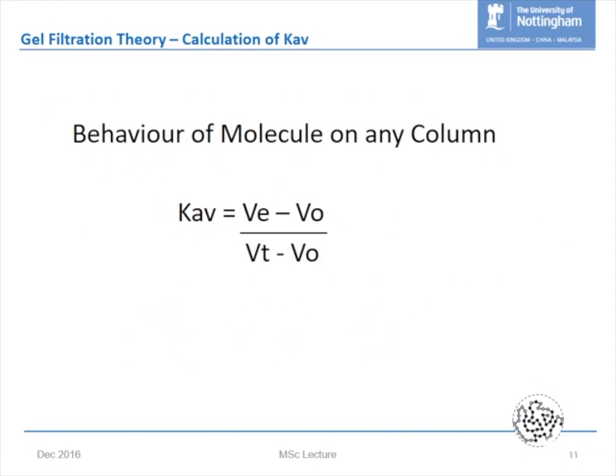You probably just need to get your head round some of those terms, but it's very logical in terms of this distribution into the pores. It's only based on the volume of the pores. And we can come up with a term like this if you substitute some of the values into the equations that I've given you. That's the basic equation that we're working to, and that's what we need to recall.